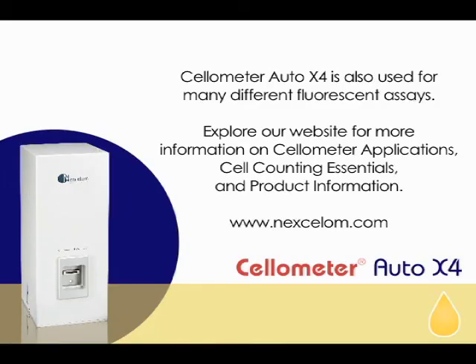Cellometer AutoX4 is also used for many different fluorescent assays, ranging from UV to visible to IR. The optical module can be switched by a user within a few minutes.